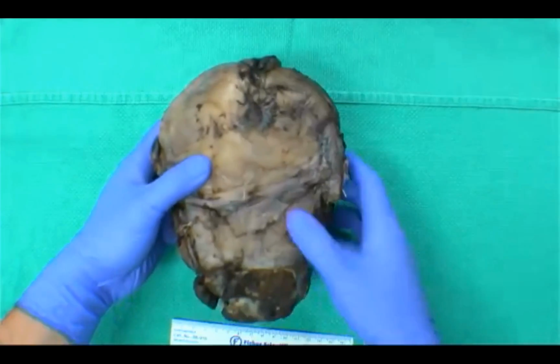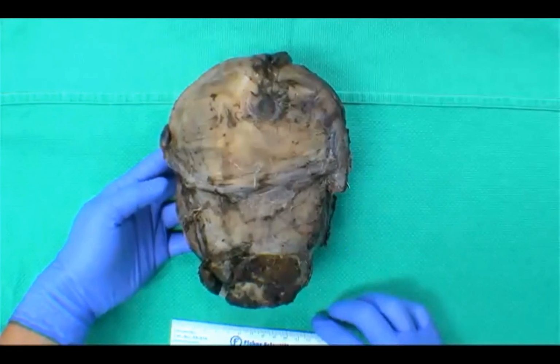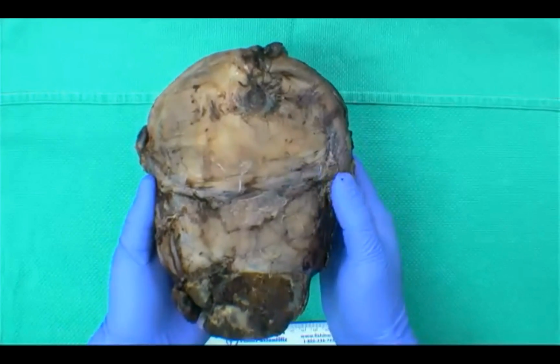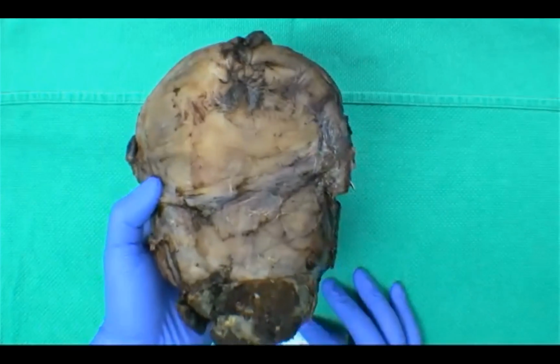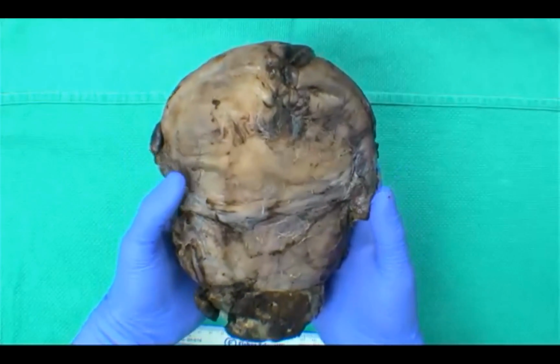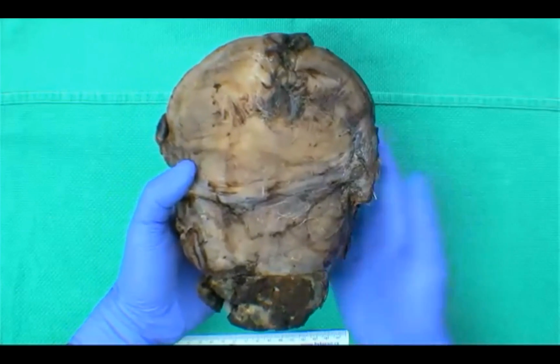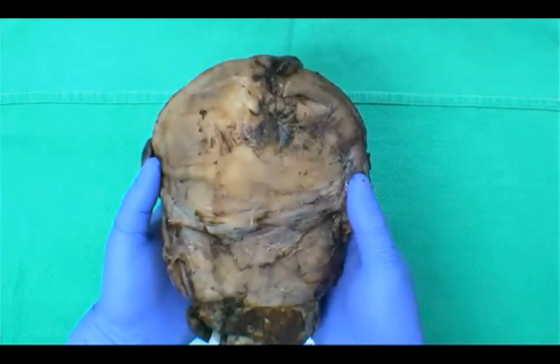Okay, great. This is our first specimen of the day. So I will slowly move it around for everyone to see. Very good, everyone. This is a uterus and cervix specimen. More specifically, this is a postpartum hysterectomy, as you can tell from its large size compared to, as you can see from the scale and my hands. I'll take everyone through the anatomy.